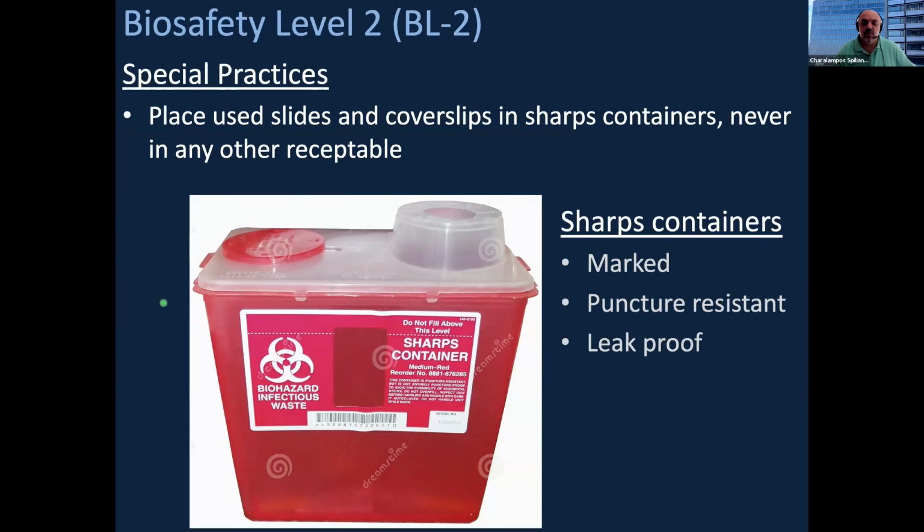insectarium and mouse rooms. Quite importantly, and we did have questions from Manuela earlier, actually, we should provide special containers to dispose the sharps. These containers should be actually specially marked. They are puncture resistant, quite important, and they are leak proof. And they should actually be disposed, as you can see here, do not fill above this level.